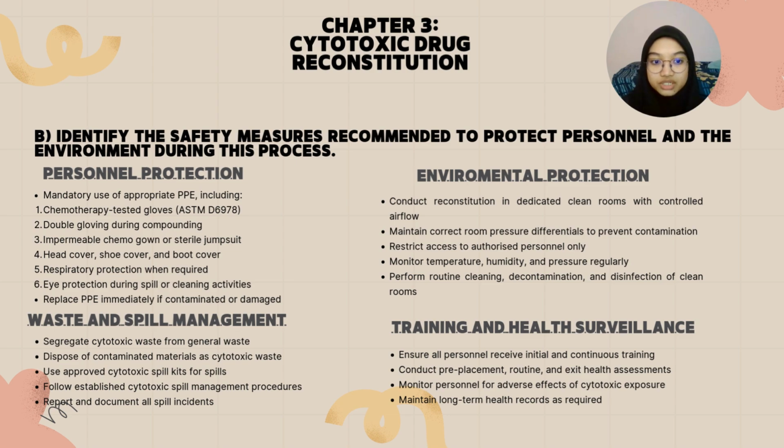Proper airflow, pressure differentials, and controlled temperature and humidity are maintained. Access is restricted to authorized personnel. Routine cleaning, decontamination, and disinfection ensure a safe environment. For waste and spill management, all cytotoxic contaminated materials are hazardous waste and must be disposed of separately.